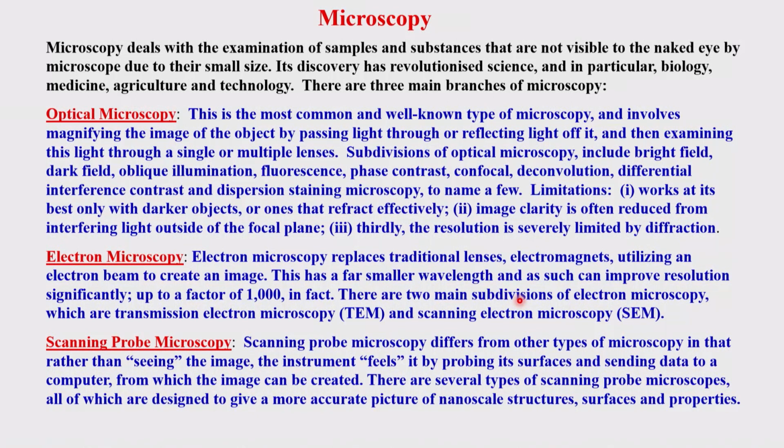Of course, not only magnification, you also need resolution, which is very important. So what are you measuring and what is the difference? The electron energies, obviously, and the difference in energy. The difference in energy divided by the total energy should be as low as possible in order to get your resolution. So one is magnification. Suppose you magnify but it's blurred, there's no meaning, you cannot get a proper image. If you magnify without blur and get clarity, then it has meaning.